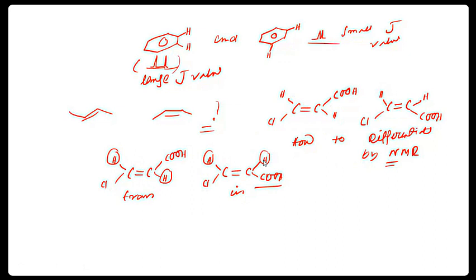I will not discuss this in that much detail, but you have to remember, or just believe, one thing: coupling is not through space. Coupling is a through-bond effect. You have to believe me, but I don't have the time at this situation to explain this now. It's a quite rigorous mathematical calculation, but just believe this statement.